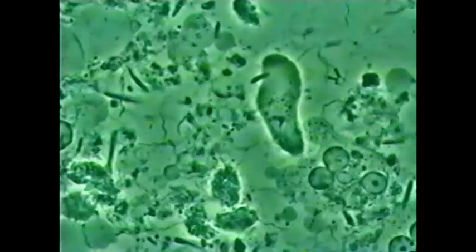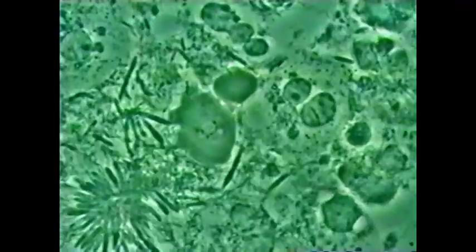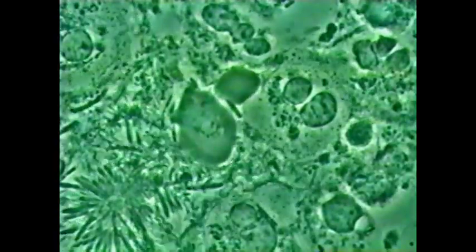We see again remnants of neutrophil, white blood cell, many spirochetes, many bacilli around them. Here again, organized bacilli around some form of actinomyces structure. And again, bacilli, spirochetes, white cells. And again, we can find one or two big amoeba, Entamoeba gingivalis with pseudopods. It's full of material they have eaten. Here again, enormous amoeba during periodontal disease.